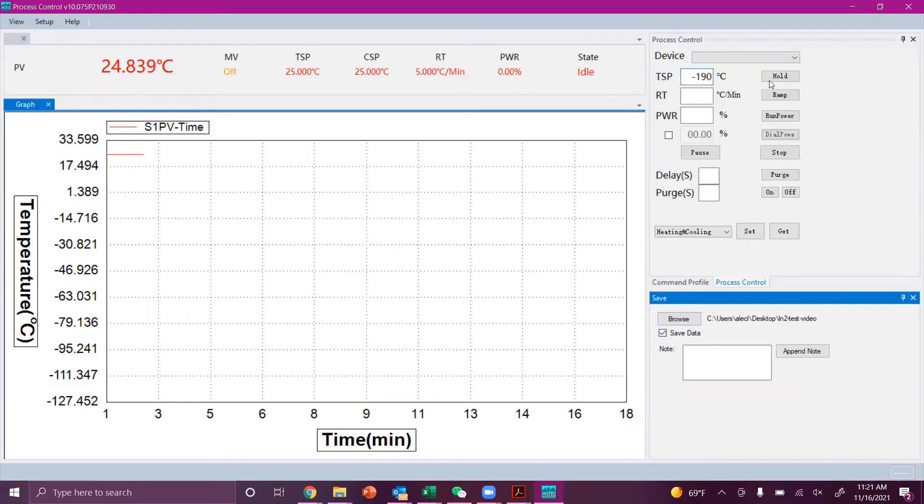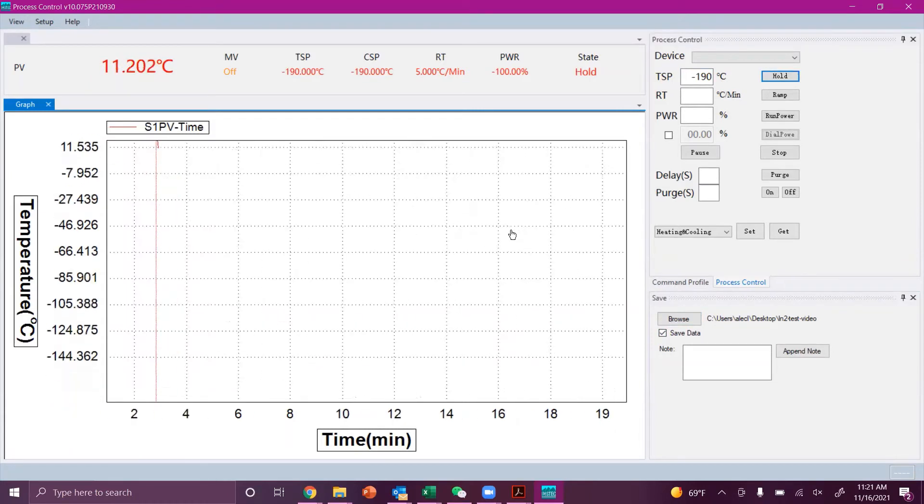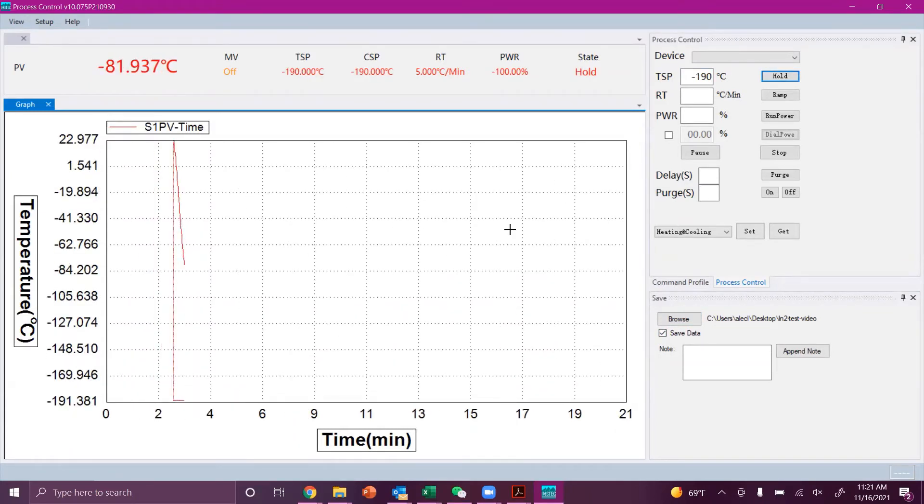You can send commands to the LN2 suction pump by using the INSTEC app software. Simply set your target temperature, in this case negative 190 degrees Celsius. You can press hold for the fastest cooling rates possible, or you can specify a ramp rate and press ramp for a slower, more controlled cooling rate.